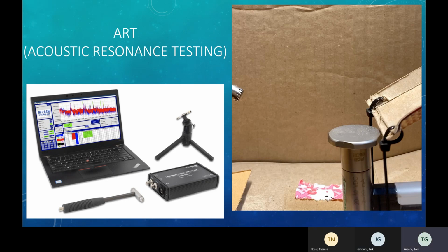Acoustic resonance spectroscopy is a non-destructive technique that allows you to differentiate between good and bad parts. Each part has a unique fingerprint corresponding to its geometry, density, and material properties. If the part is defective or contains a crack, or in this case, under or over-sintered, the resonance spectra will shift. In the picture below, a hammer impacts a part, and the sound of this excitation is then recorded by a microphone. The microphone then records this unique signal, which an algorithm converts into a spectra that is unique to each part.